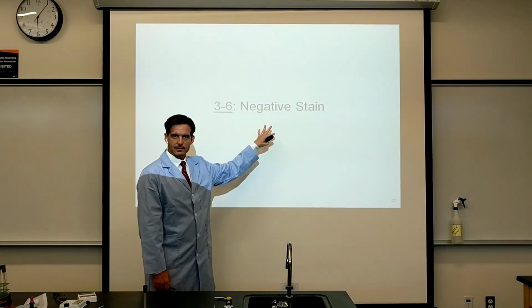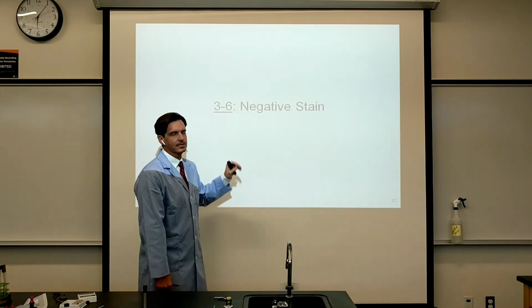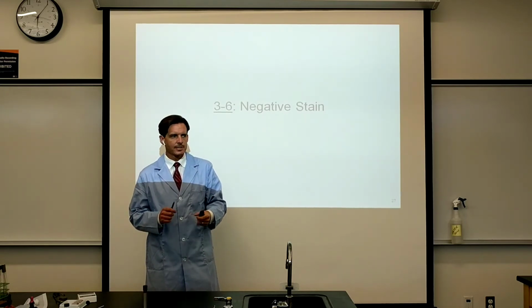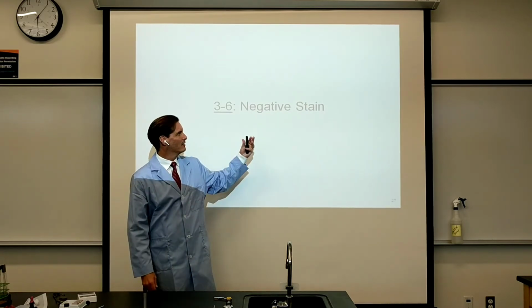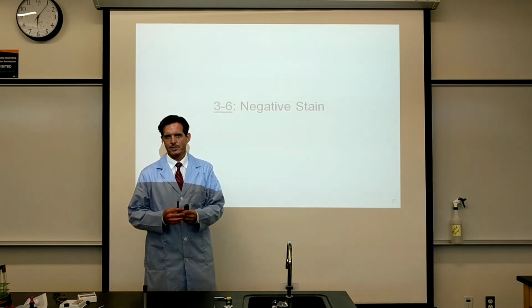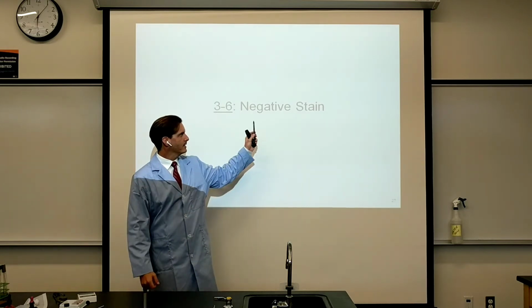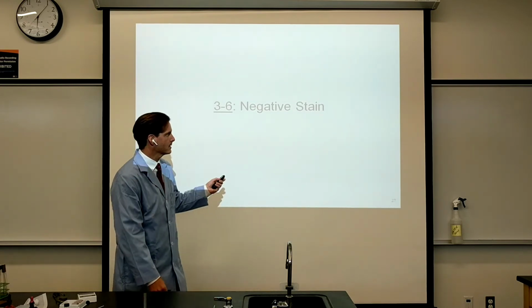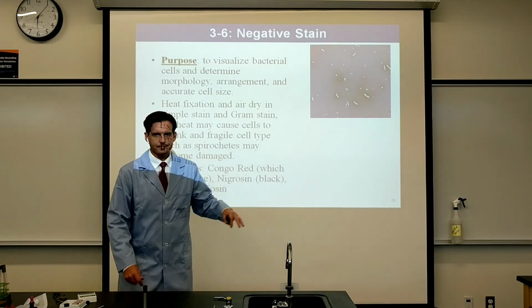Finally, this is our last topic for today, and it's the negative stain. The negative stain is a lot like the simple stain, so we're going to learn some of the same concepts, but the negative stain is sort of the opposite of the simple stain, which is strange. If you know the simple stain really well and you've studied to remember the different take-home points about the simple stain, the negative stain will just be like reversing it. So let's look at this technique. The negative stain, I'll give you an example on reversal.